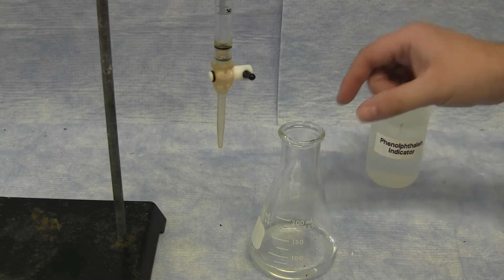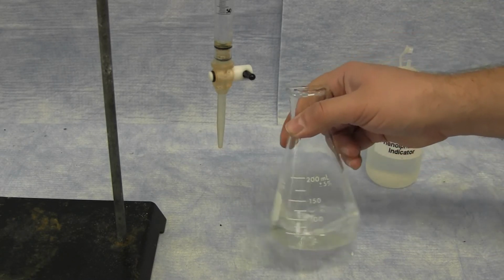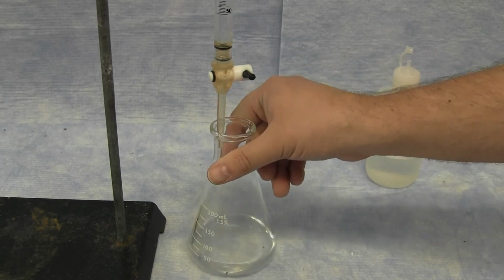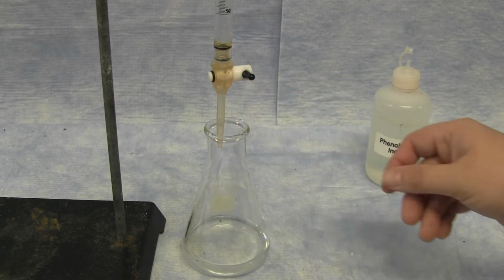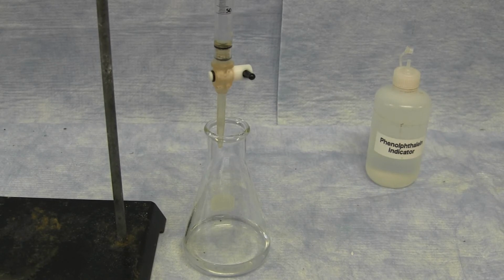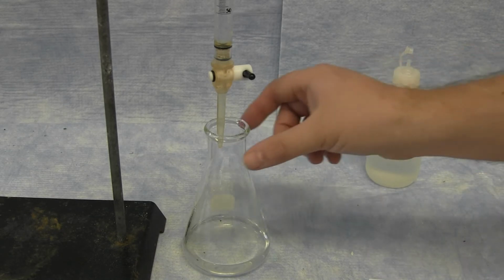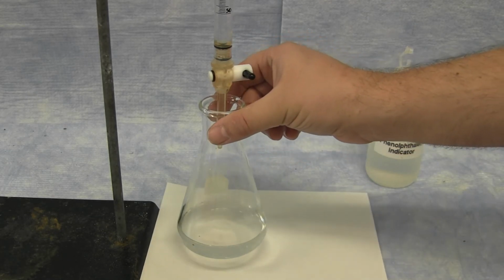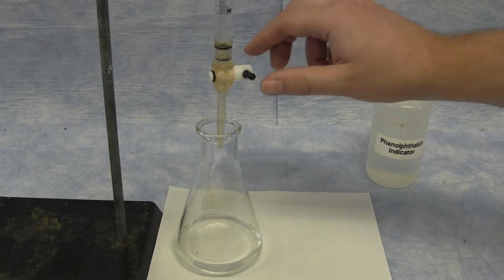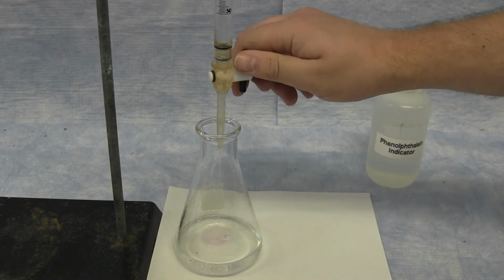This indicator solution is colorless in acidic solutions and turns a pink color in basic solutions. When the solution color turns pink, the titration is complete. In the lab on the dark benchtops, it may be useful to add a white piece of paper below the flask. In this way, you will very easily notice when the solution turns pink and remains pink.